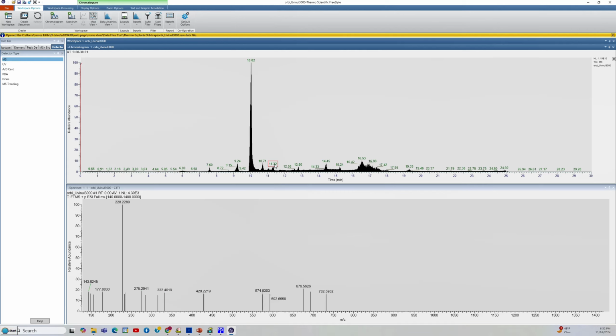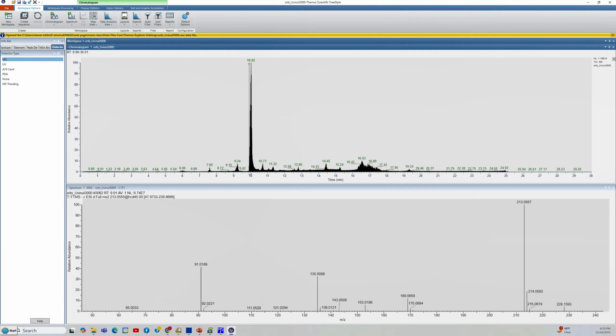And what comes up is the total ion chromatogram, which is the positive and the negative, and it's the MS1 and the tandem MS2, all put together in one file. So it's not real useful, and you might not know which component's the major one, but we'll just look through the big one, assuming it's right. You just left click on it, like there, and I'm going to the keyboard, the right arrow, and it just steps across it.